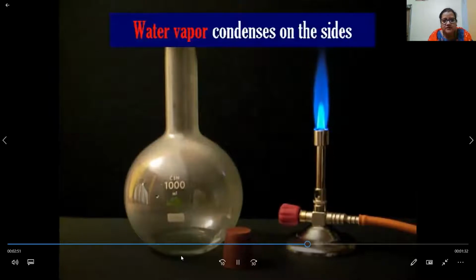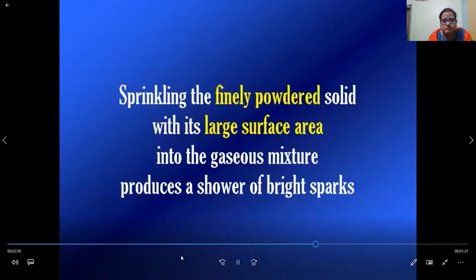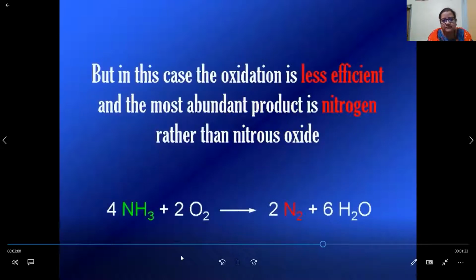Water vapor condenses on the sides. Bright sparks. Looks like fireflies, isn't it?